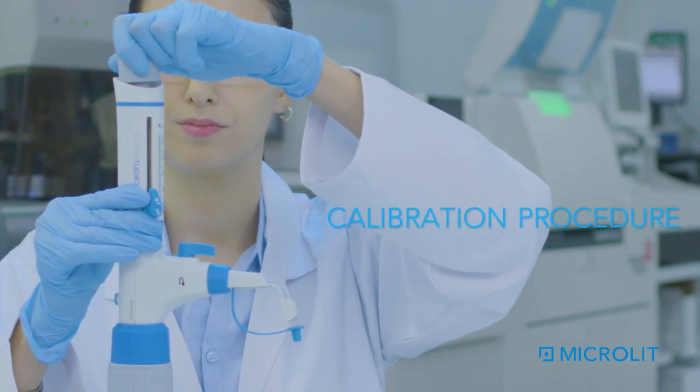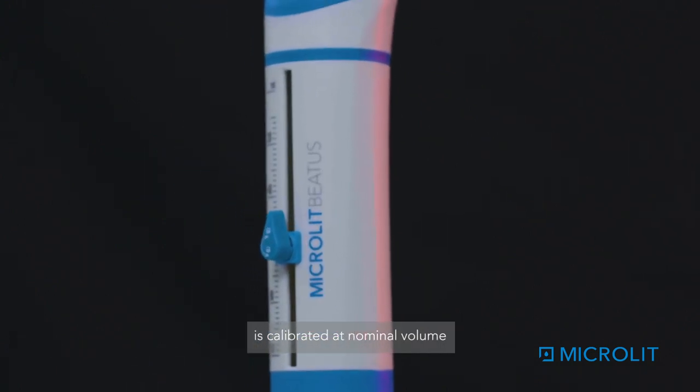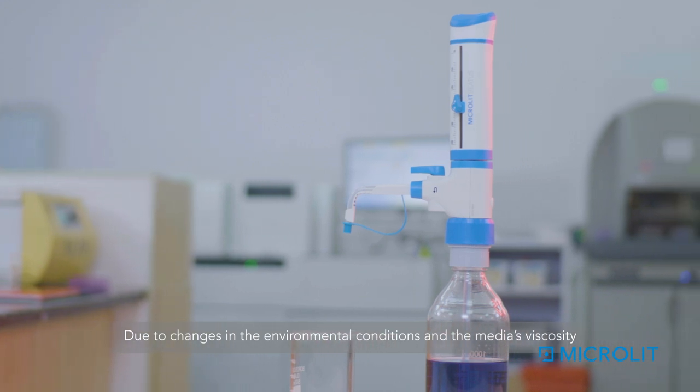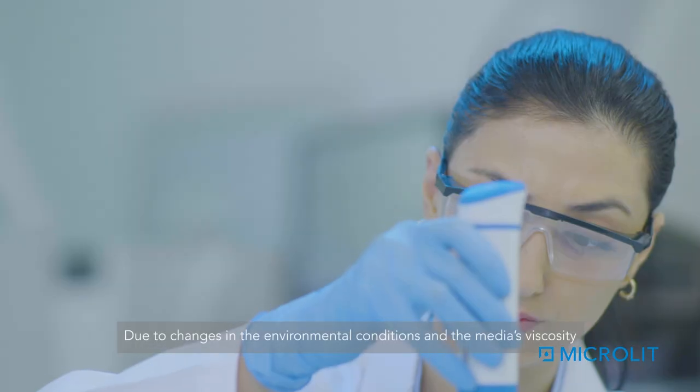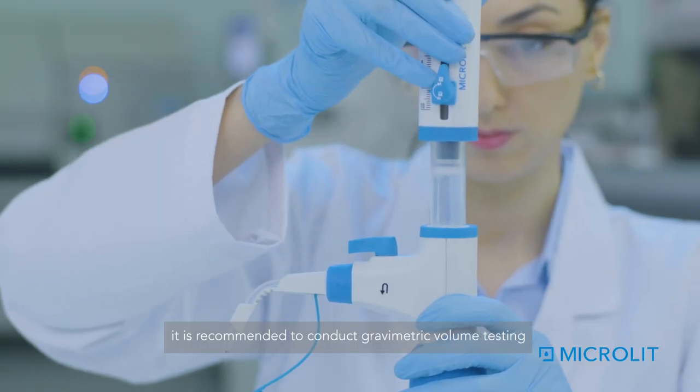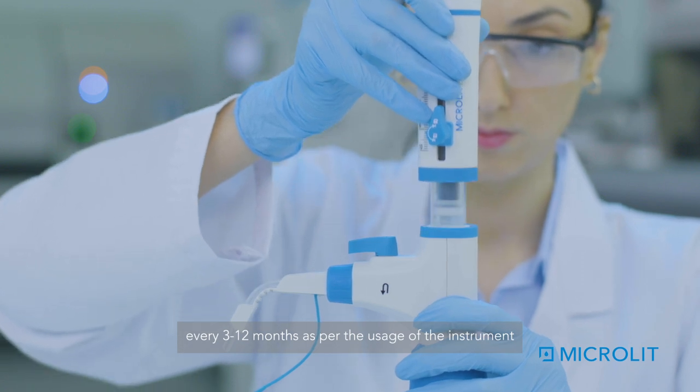Calibration Procedure. Microlit's Betis Bottle Top Dispenser is calibrated at nominal volume. Due to changes in the environmental conditions and the media's viscosity, it is recommended to conduct gravimetric volume testing every 3 to 12 months as per the usage of the instrument.